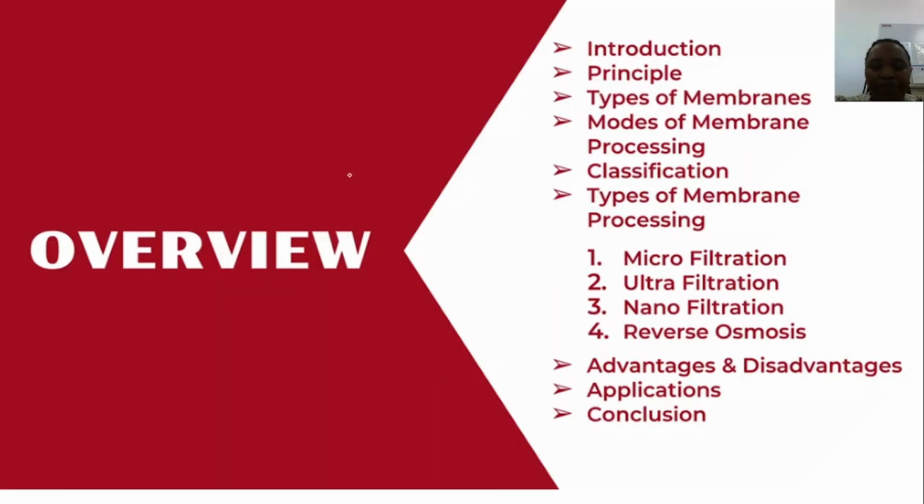membranes. Just to have an overview, we'll have the introduction, then the principle, types of membranes, the modes of membrane processing, classification, types of membrane processing, the advantages, disadvantages, and how we apply them.